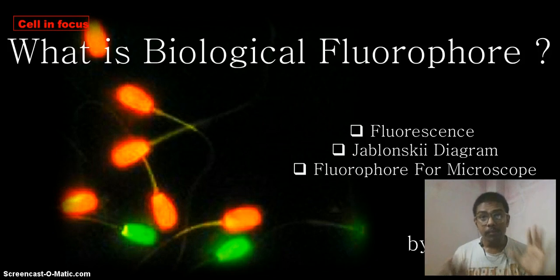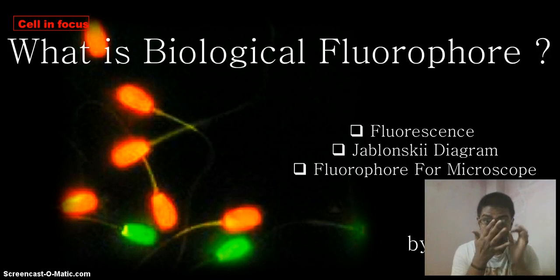That's why the emission light, what you are returning back in de-excitation, has less energy as compared to the excitation light. And we know energy is inversely proportional to wavelength. Energy is proportional to 1 by wavelength. Whenever in emission light you are getting lower energy, then obviously the wavelength of your light will be increasing. That's why emission light is greater in wavelength as compared to the excitation light, and at the same time emission light is less in energy as compared to the excitation energy.